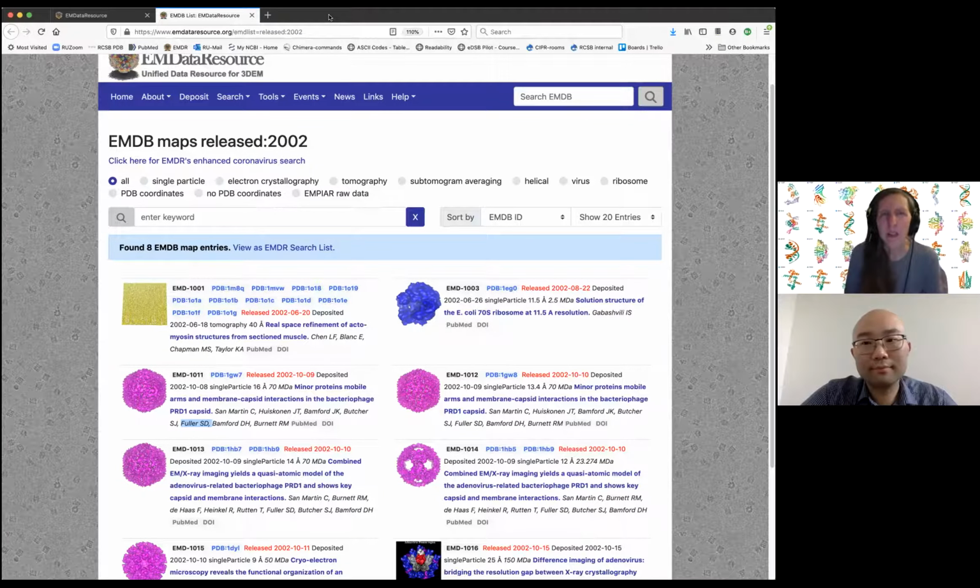And a few years ago, everybody was getting confused for years about EMDB versus EMDataBank, because we had been calling ourselves EMDataBank.org or the EMDataBank project. But EMDB, again, is the data archive, and we were trying to differentiate ourselves as the project.